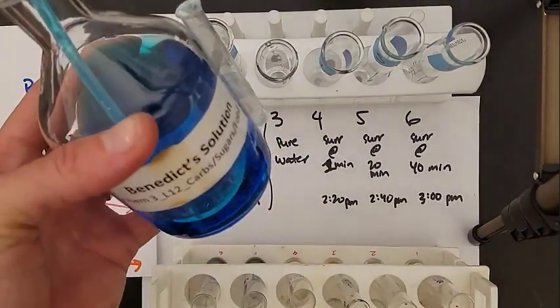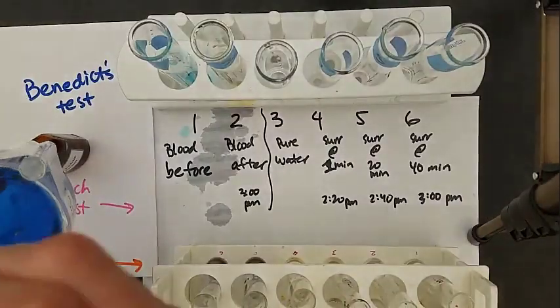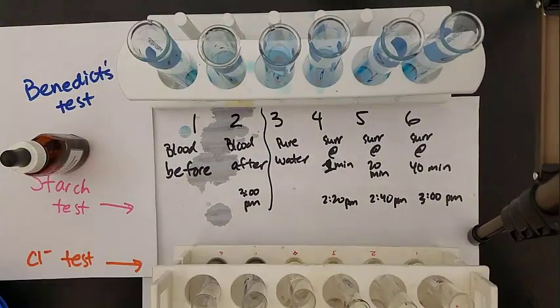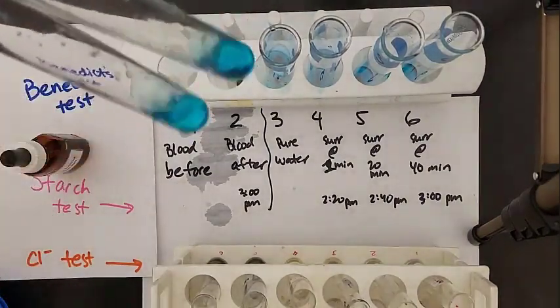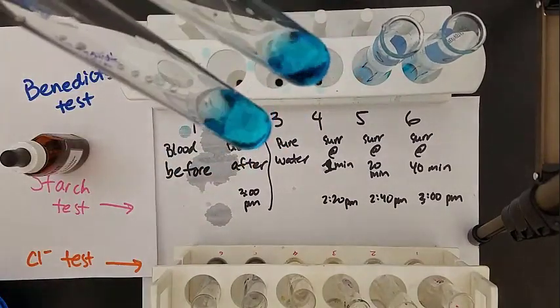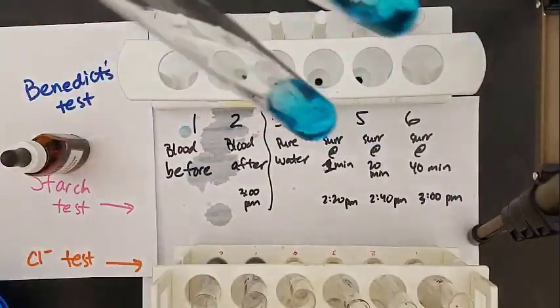Now we'll do the Benedict's test. This tests if glucose is present in the solution. We'll add a couple mls of Benedict's solution to each test tube. Done for all six now. No reaction yet—they're all transparent blue to start. But if we give a little heat to the reaction, that'll speed it up.